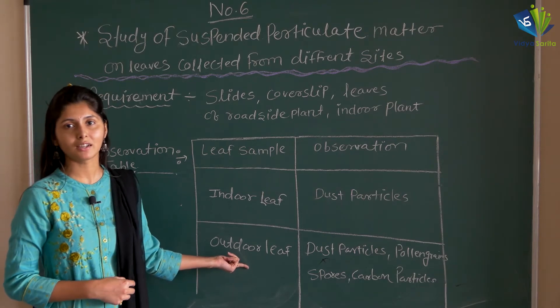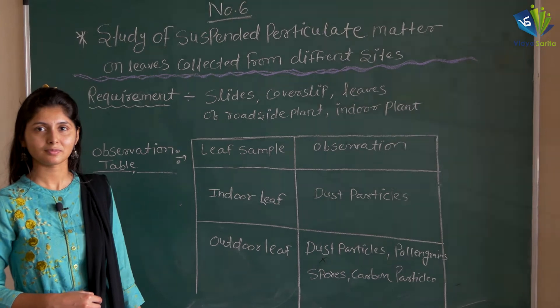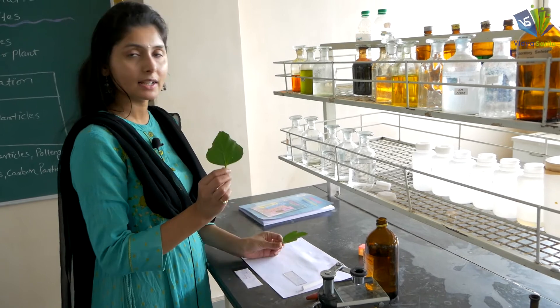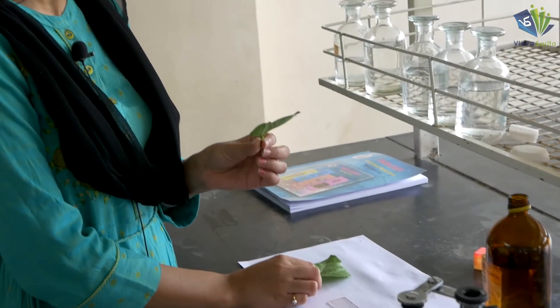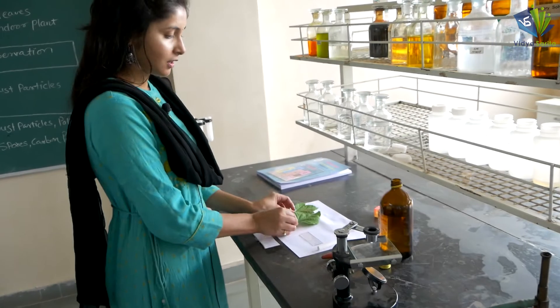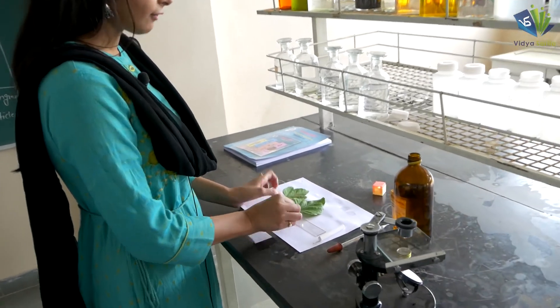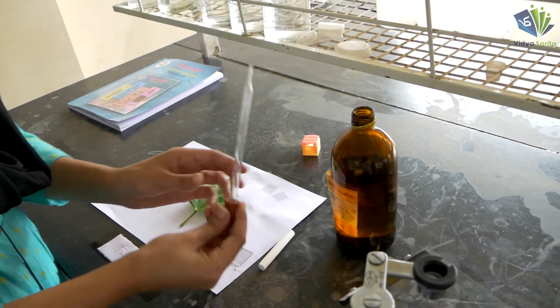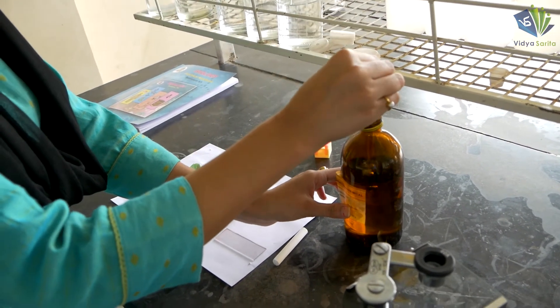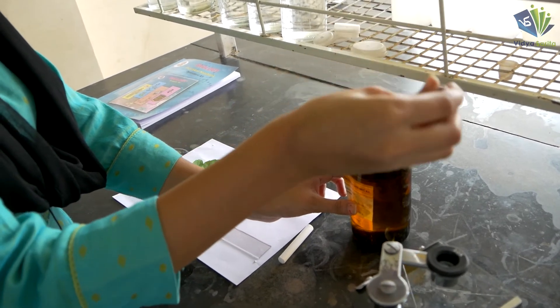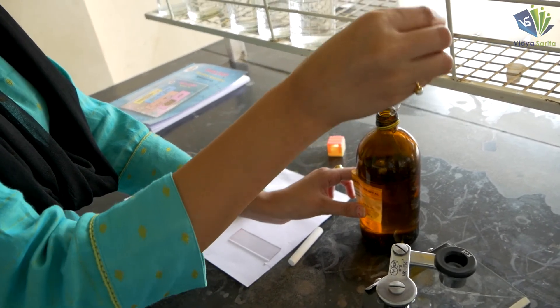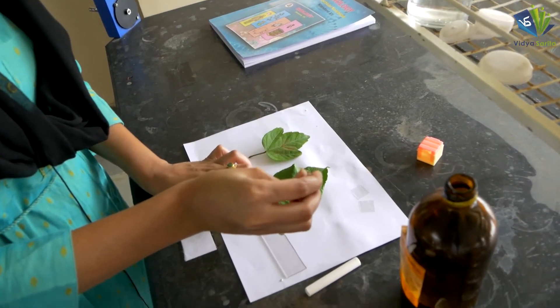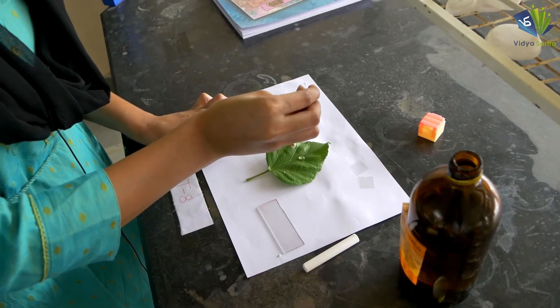So let us do it practically. We have two leaves — this leaf is an indoor plant leaf and this leaf is an outdoor plant leaf. We have to put a drop of glycerin on both leaves. Take a dropper, take a drop of glycerin, and put a drop on both the indoor and outdoor leaf.